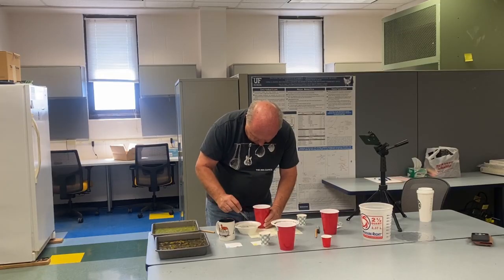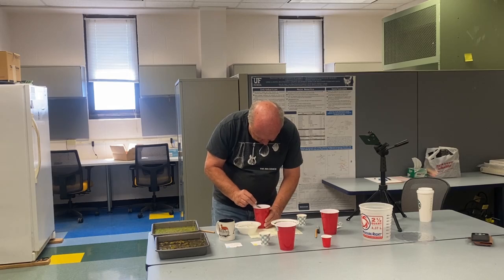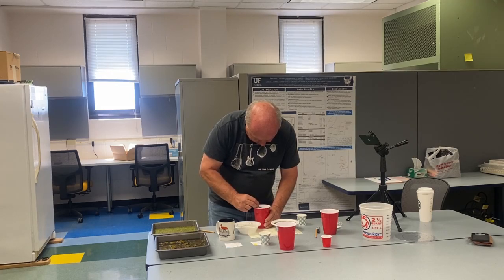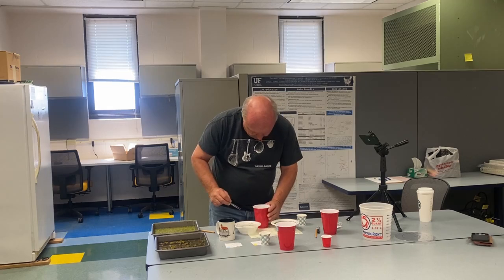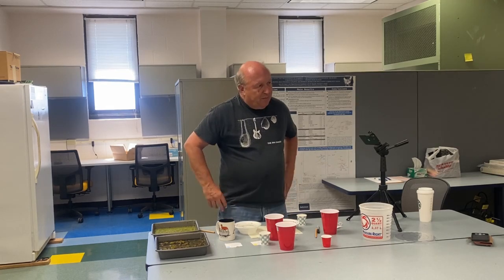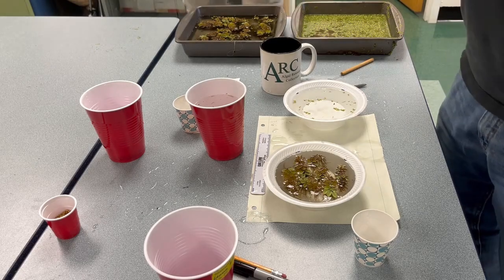Depending on where these duckweeds come from, you might see that you have some bugs crawling around in the water, like they might be little amphipods or insects or something like that. And that can be fun, but you should take a note of those things, or anything else that you see. Second picture, just like the first one.